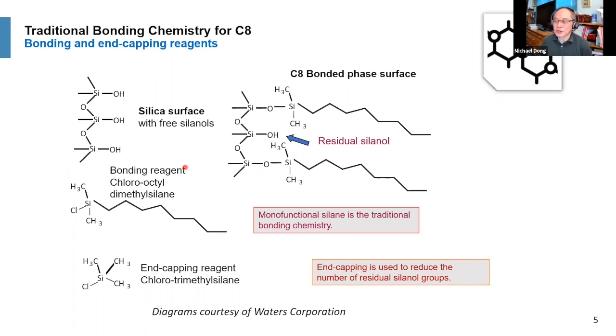So in order to have a high surface area to do all the bonding, to do all the interaction, you need a porous silica, right? In the early days of liquid chromatography, we took sand and treated it to make it porous, and made it round or into something which we can sieve. Sometimes we sift it to give you different particle sizes. And those silicas are irregular. They're not the best chromatographic media. Later on, we got better and better, right? Now they are becoming very expensive.